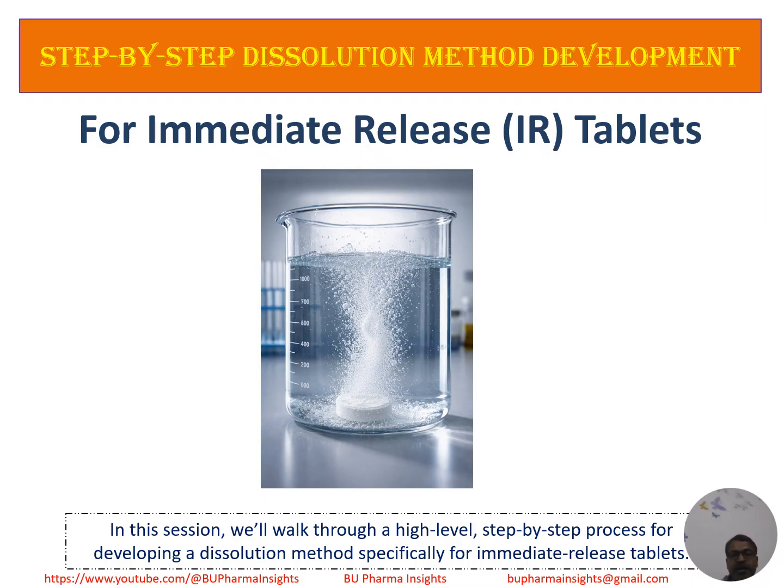Now onward we will have 10 videos on dissolution method development for OSD formulations. In this video I will introduce dissolution method development as a structured science driven process for immediate release tablets. For this we will focus on solubility, method robustness, and discrimination.